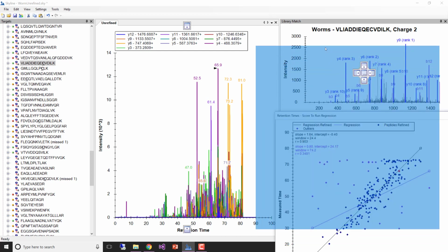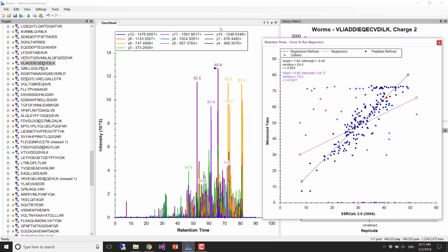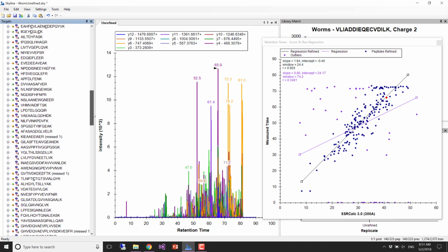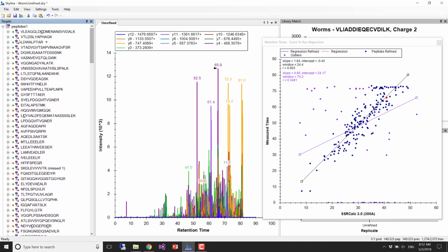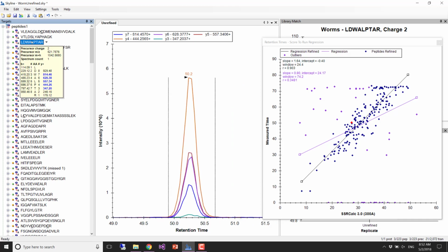And then there's also potentially using DIA. But I wanted to show you the idea of, okay, here we have these not so great measurements. If you're sticking around for the capstone, we'll go through DIA, and you might get a set of potential targets through DIA, and then you would definitely have IRTs.